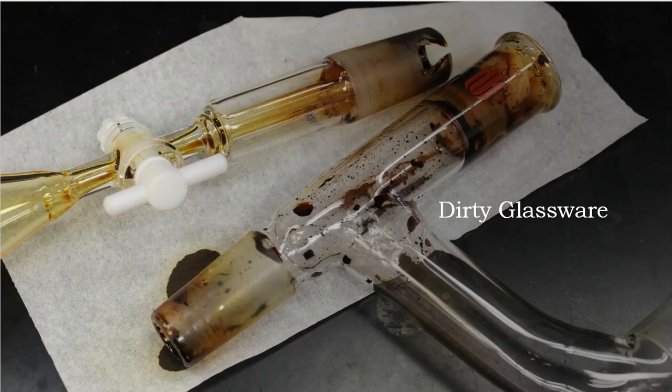And now my time starts. My time starts at 3:04 p.m. So here's my filthy, dirty glassware. I'm going to take this filthy, dirty glassware that's stained with iodine at this time, and I need to get the iodine off of there. So I'm going to rinse this stuff with acetone.